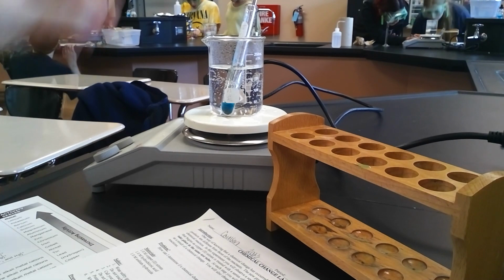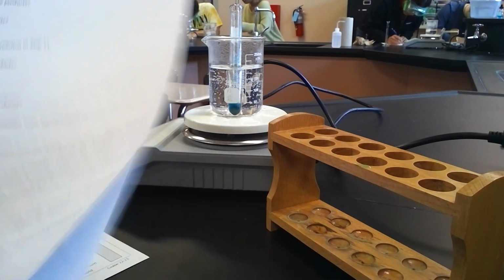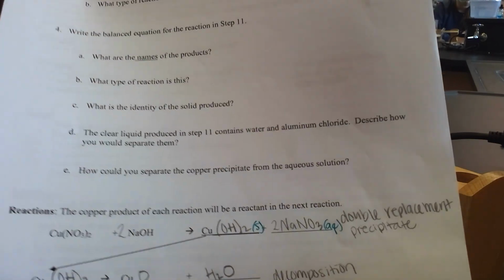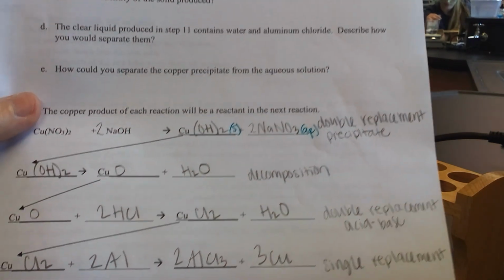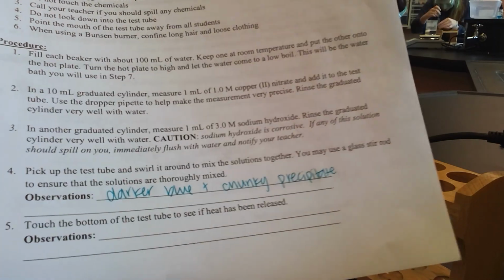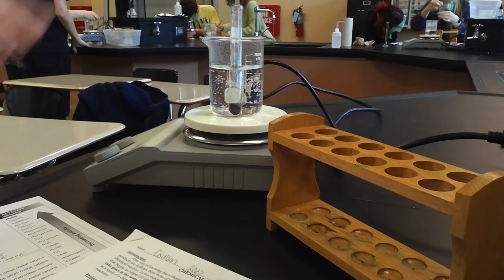Part of the reason that I wanted you to get your reactions listed out before the lab is so that you could actually tell me what the precipitate was that was formed. And so based on the reaction that we predicted, we said the precipitate itself would be CuOH2, and then the aqueous solution would be NaNO3. So based on what we saw, you should be able to tell me the qualities of the aqueous solution. So sodium nitrate, what would that look like versus copper hydroxide, or copper 2 hydroxide? So that is okay for your observation, but when you think more in depth about your analysis, you should be able to tell me specifically which one was the chunks and which one was the aqueous solution.